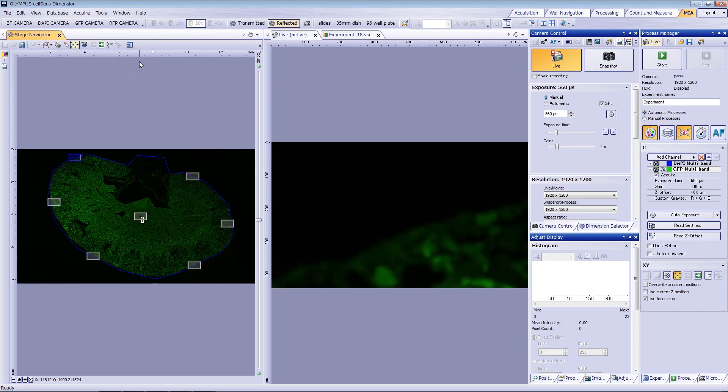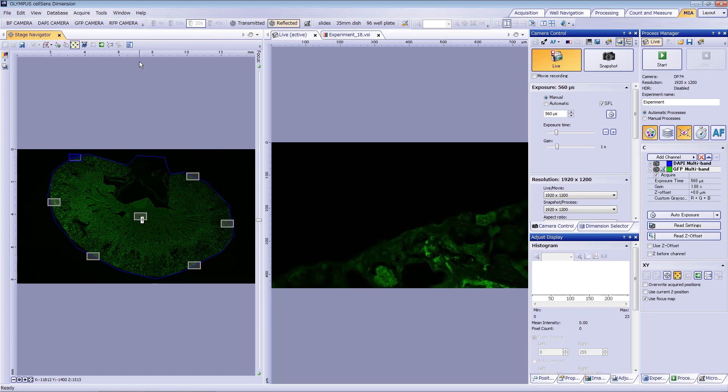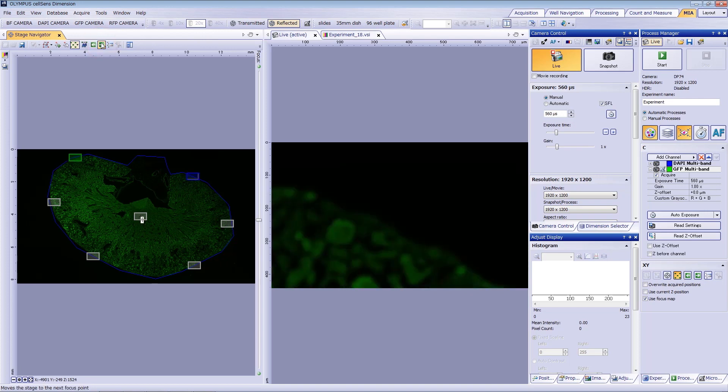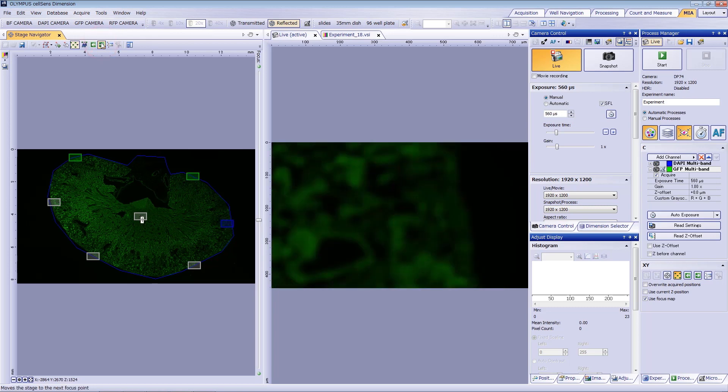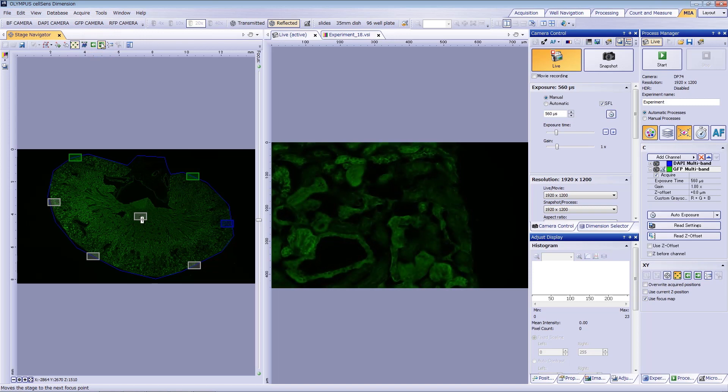The live window will automatically open so that you can change your focus. The rectangle you are adjusting will be highlighted in blue. Click the arrow to move to the next focus map position. The rectangle will change from blue to green to show that the focus has already been defined for that position.